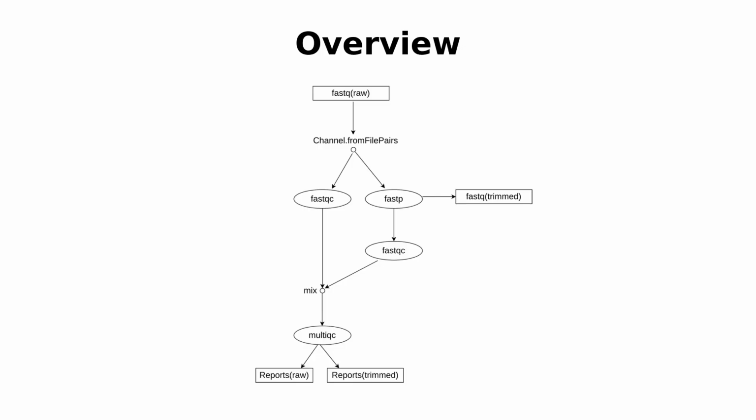That'll be all for this tutorial. And so here we've covered what? Getting FASTQ files into a channel, running FastQC for the raw reads, getting trimming done, running FastQC for trimmed reads, getting multi-QC. And so this becomes it. That'll be all for this tutorial.